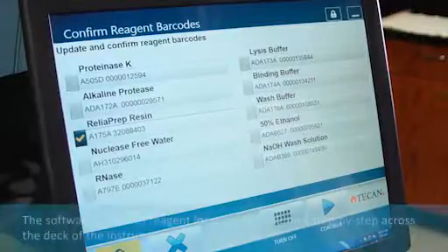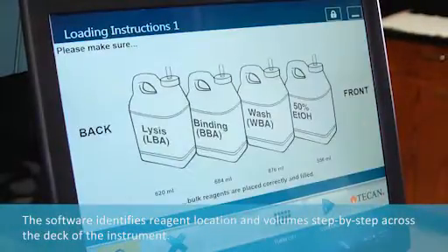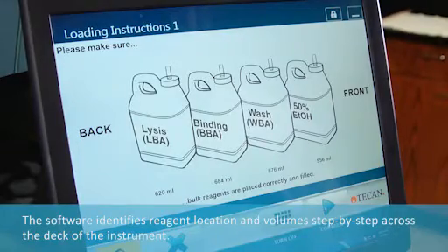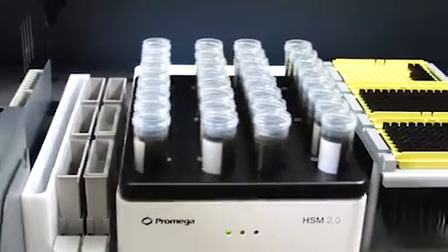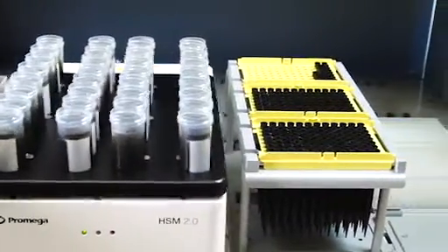Large-volume reagents are housed in bulk containers. The software identifies reagent location and volumes step-by-step across the deck of the instrument. The efficient layout maximizes use of the 1-meter deck for sample processing.